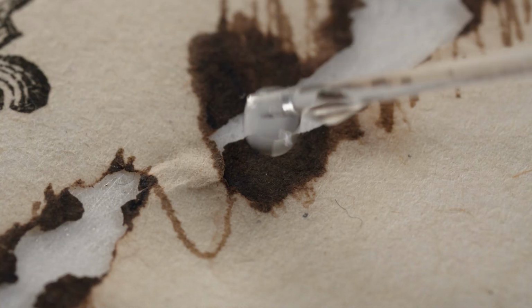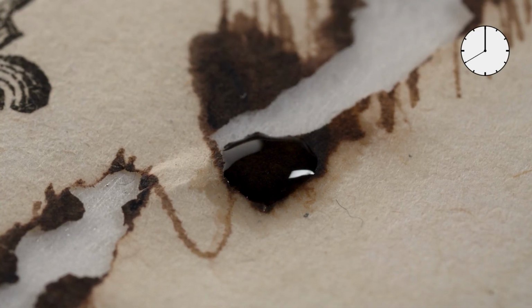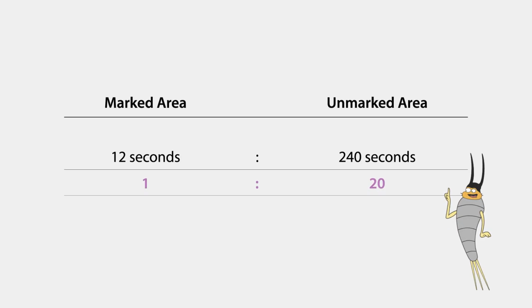Afterward, the wetting time on a superscribed area is tested by repeating the same steps. If the proportion of the two numerical values is greater than 1 to 20, there is a risk of tears and losses in the areas covered with ink during an aqueous treatment.